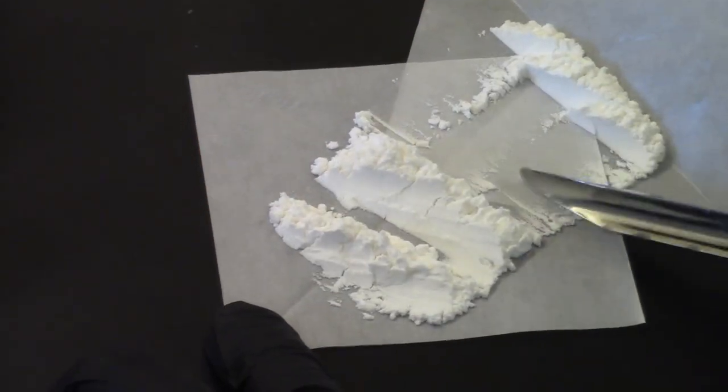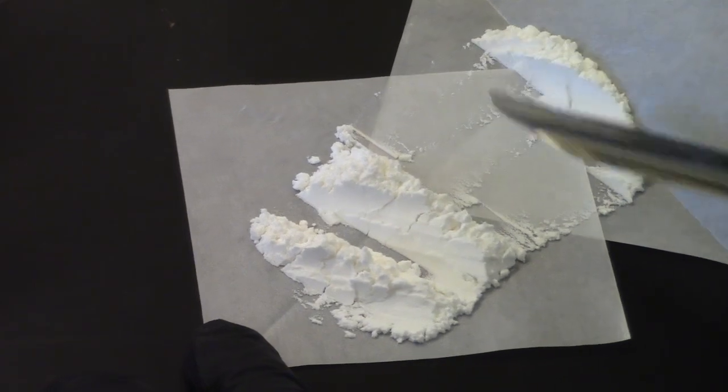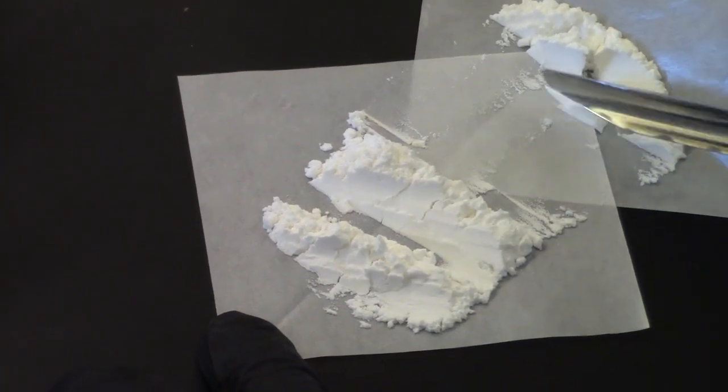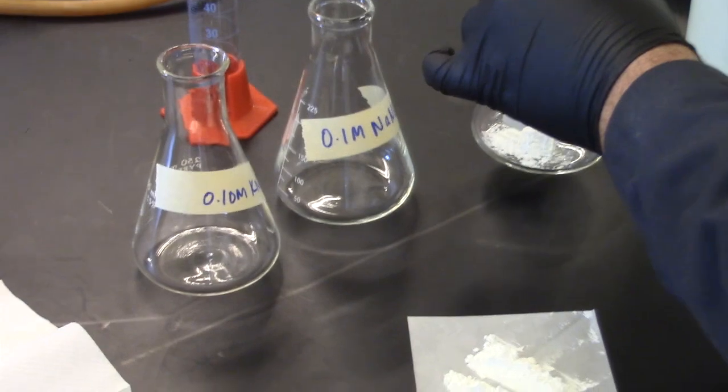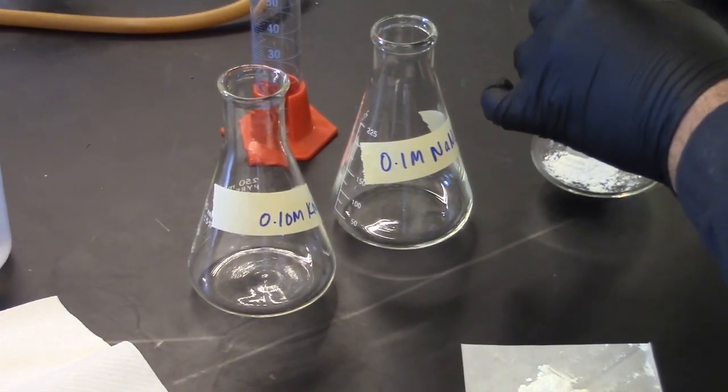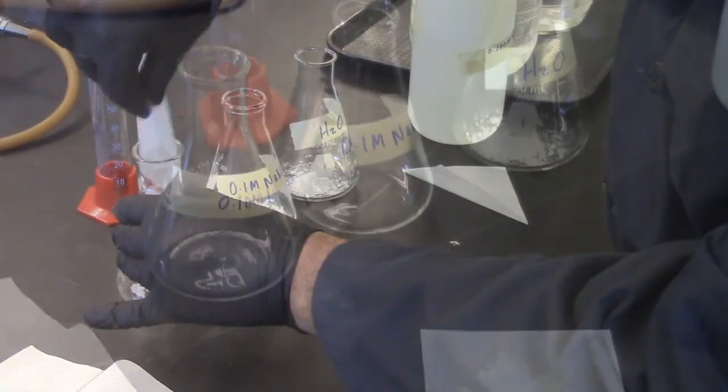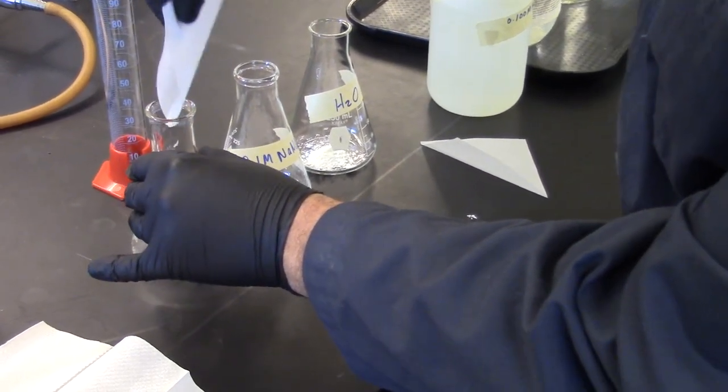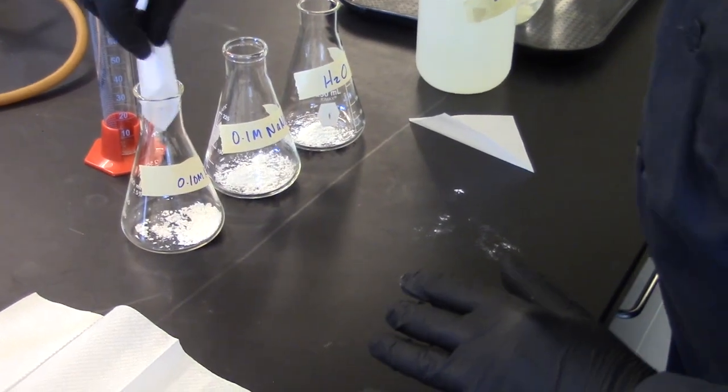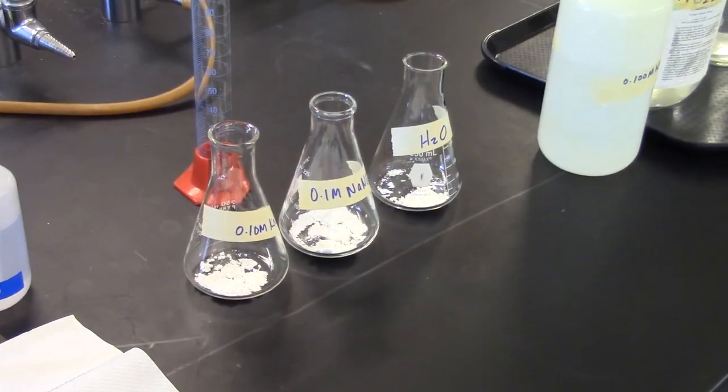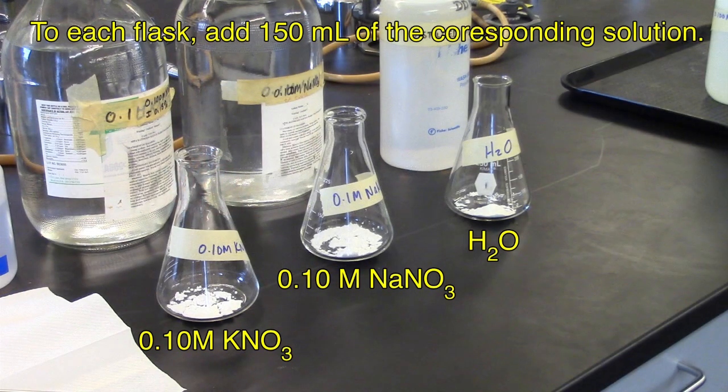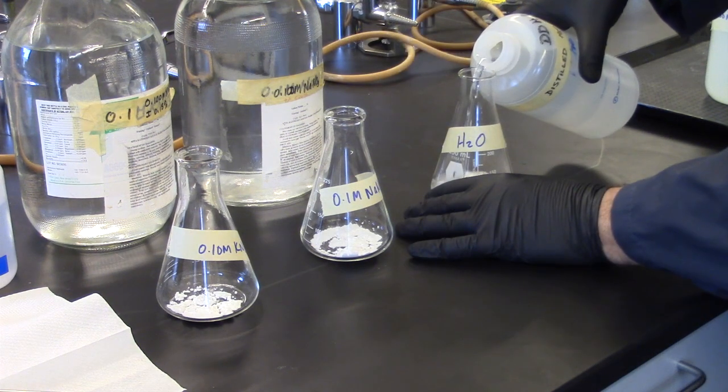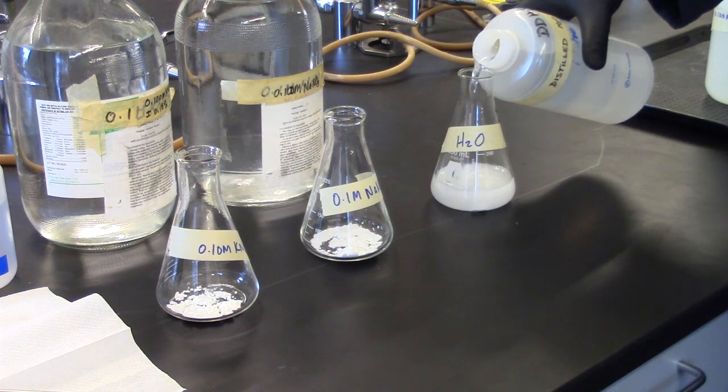Transfer one-third of the portion to weighing paper and add to the flask labeled water. Now you have approximately two grams in each flask. Add to each flask 50 ml of each solution. The graduation in the flask is adequate; you do not need a graduated cylinder.